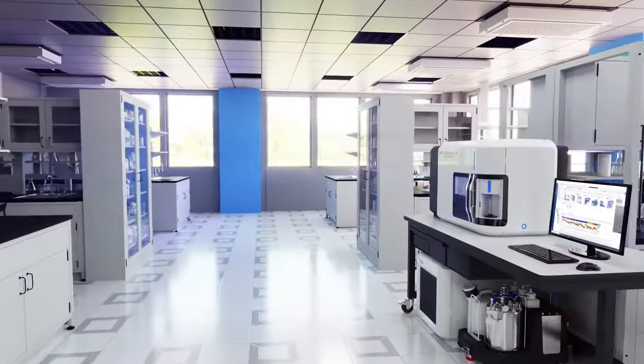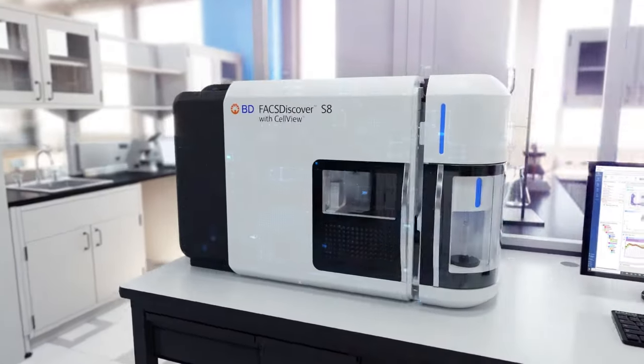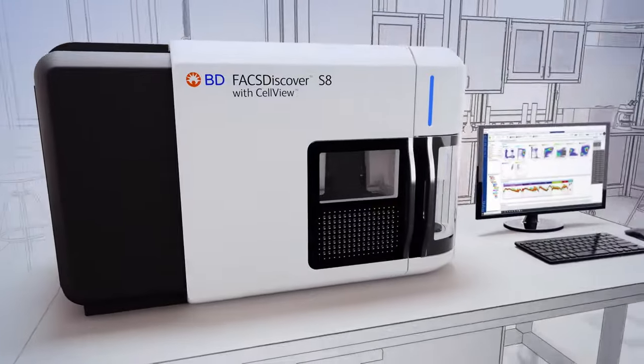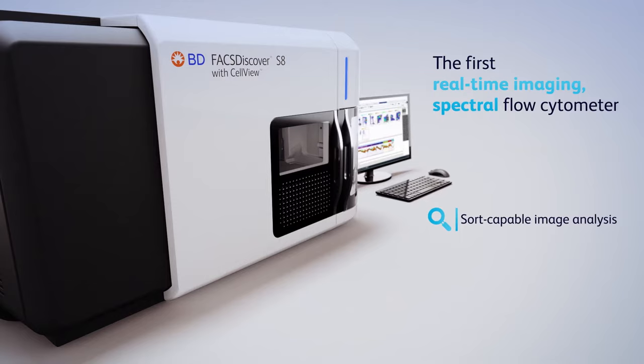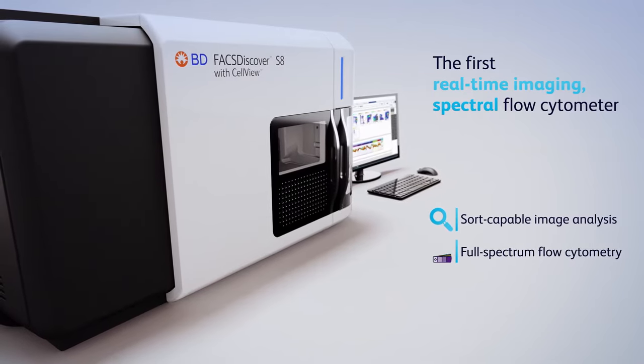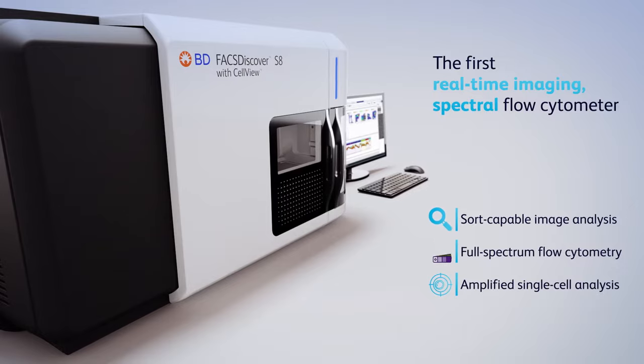Introducing BD FACSDiscover S8 Cell Sorter with BD CellView Image Technology and BD Spectral FX Technology. The first real-time imaging spectral flow cytometer with sort-capable image analysis and full-spectrum cytometry, our cell sorter amplifies the power of single-cell analysis and sorting.